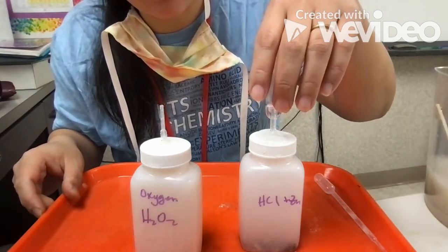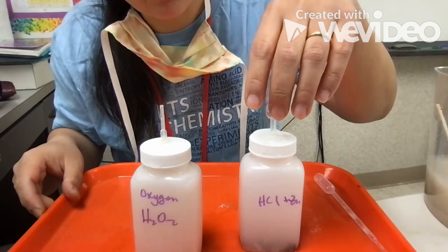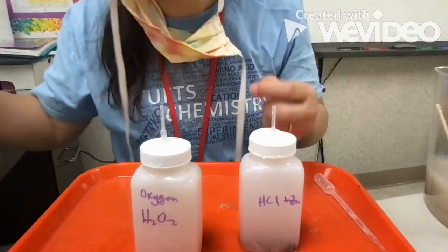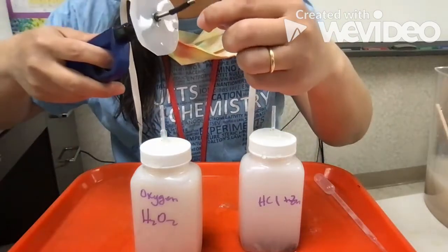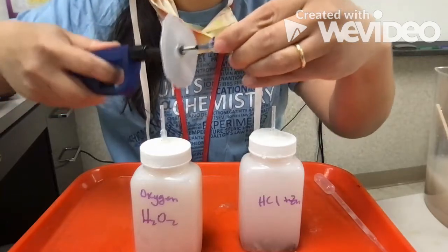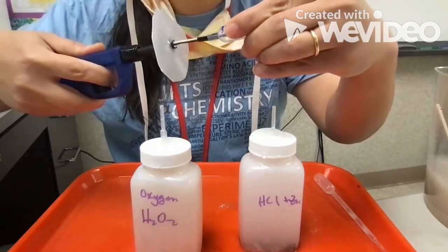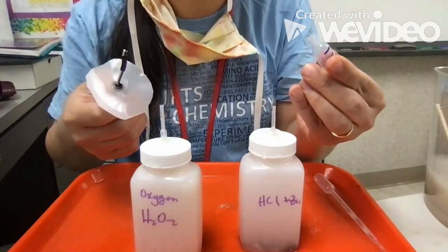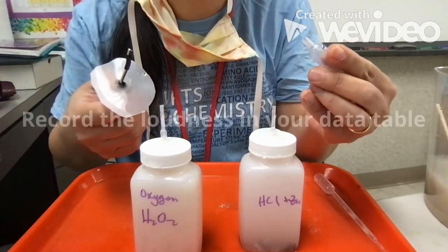Okay, almost there. Okay, so then I put my finger over it. I get my sparker. Again, make sure you're holding on to the rocket. Okay, and okay, so there's a little bit of a noise there now. So that is your hydrogen pop test, okay?